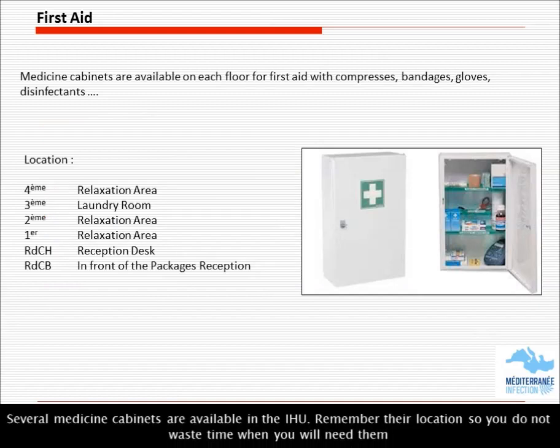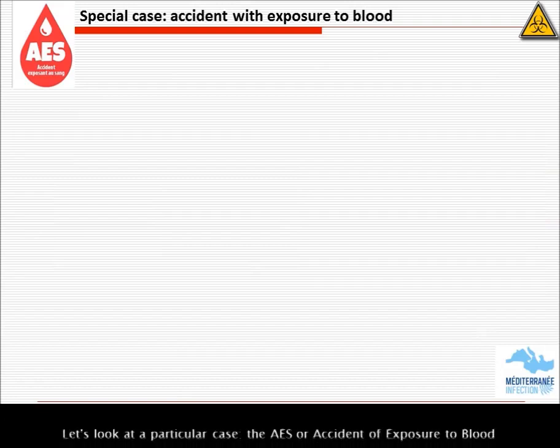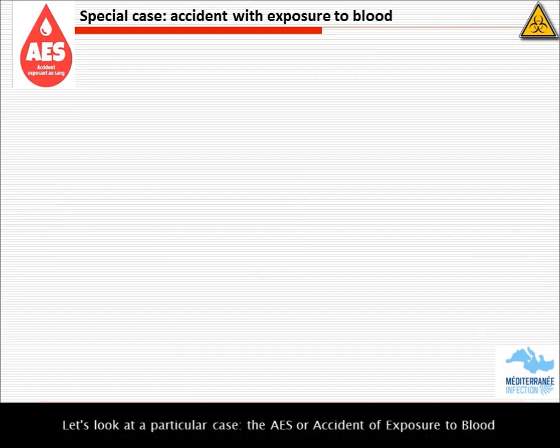Several medicine cabinets are available in the Institut Hospitalo-Universitaire. Remember their location so you do not waste time when you need them. Let's look at a particular case: the AES, or accident of exposure to blood. This is a risk that may affect you if you are going to work with material of human origin, and therefore potentially carrying infectious agents.